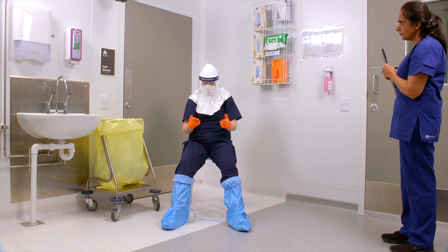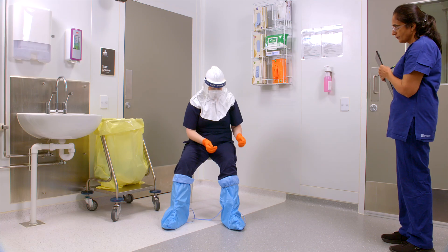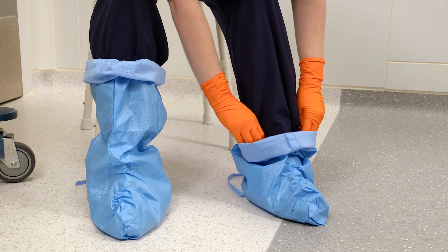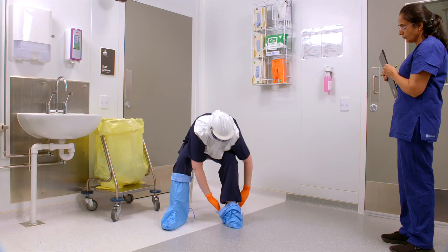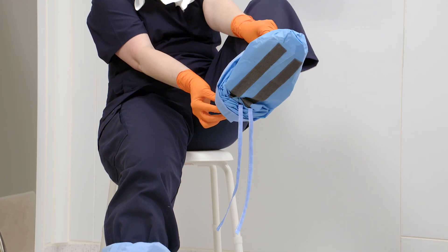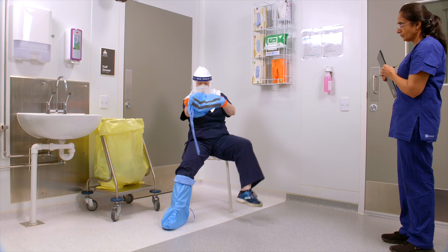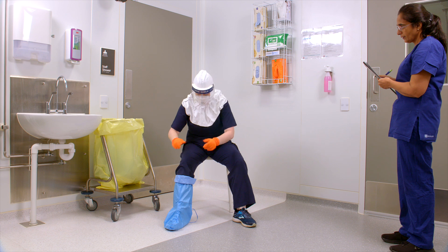Before removing the booty, check for glove contamination. Push the booty down to your heel. Remove the booty by grasping the calf at the heel area and pulling away from the body. Discard the booty into the clinical waste bin. Repeat on the other side.